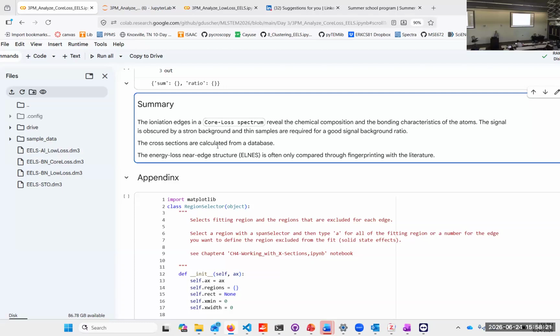And of course, you get a noise-free representation, which you then can also compare to the literature, and possibly pattern finding is something machine learning is very good at, right? So one can even make literature search and then compare them with the different parts and see what the coordination is.